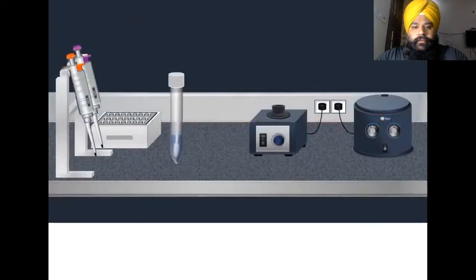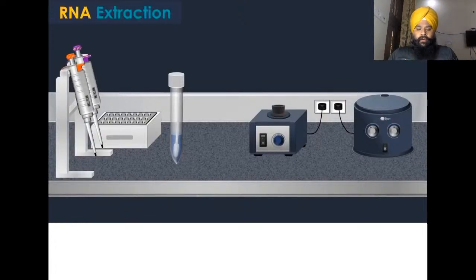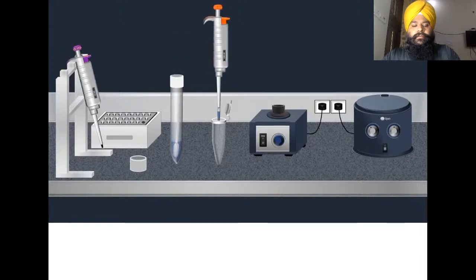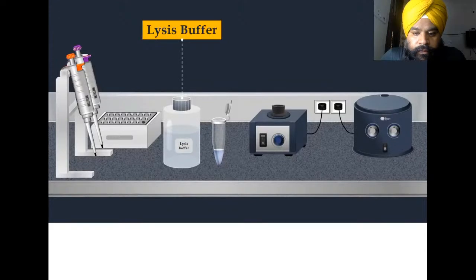To perform this method, basically viral RNA should be extracted. Several RNA purification kits are available for convenient, fast and effective isolation. To extract the viral RNA using a commercial kit, the sample is first added into a microcentrifuge tube. Then it is mixed with a lysis buffer.